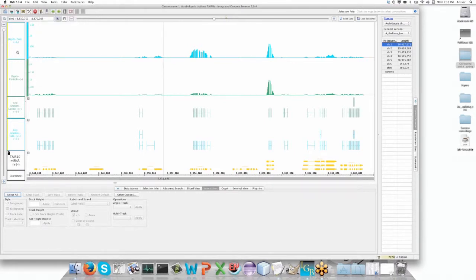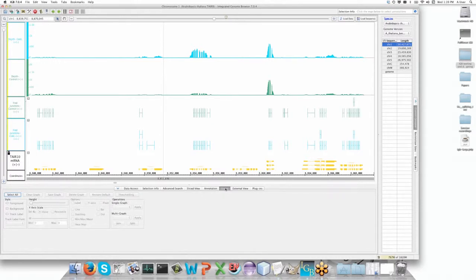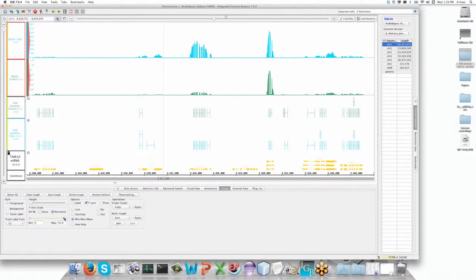The first thing you'll notice in these depth graphs is that if we look, these look approximately the same. This looks like there's a lot more cold than there is control, and yet I point out that they're actually on different scales from each other. We're going to go to the graph tab now, and when we look at these in the graph, we notice these are set to 100%.